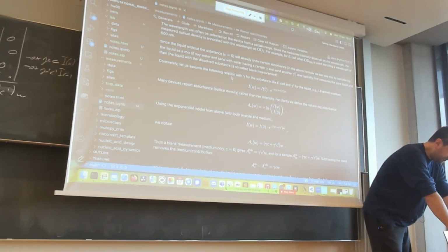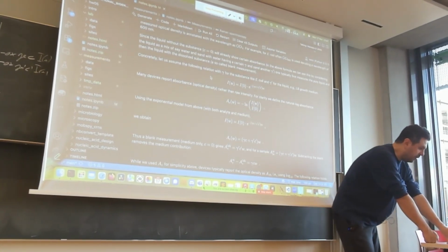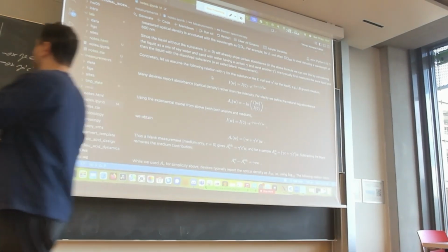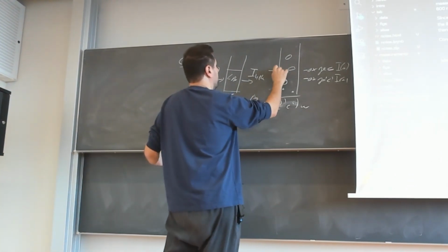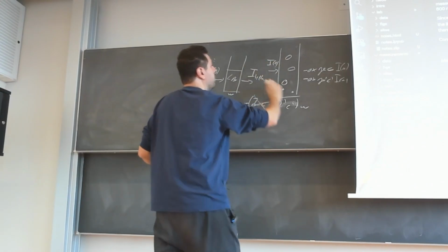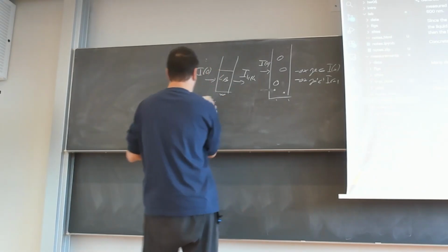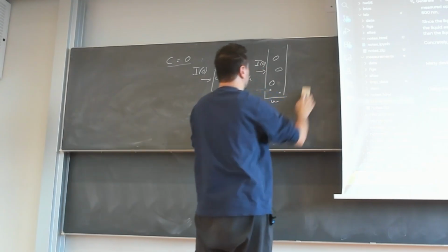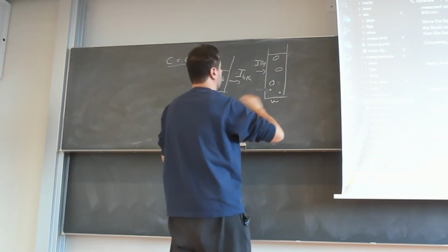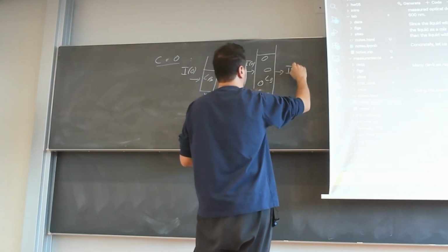Let's call it blank here. And then we do the same thing with the E. coli. We have I0 here, and we will get some, now this is a W, and this is removed. This is LB and bacteria, and we will get some I measurement outside.